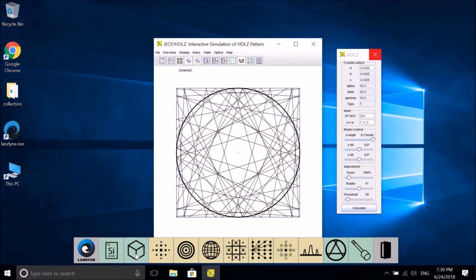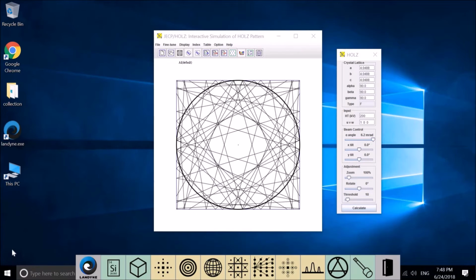SVAT2 can be used to display the structure data, to check if the structure is correct. In addition, you may convert structure data directly in CIF format in SVAT2. It will save your time in preparation of a new structure data.